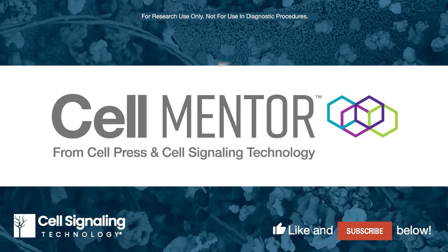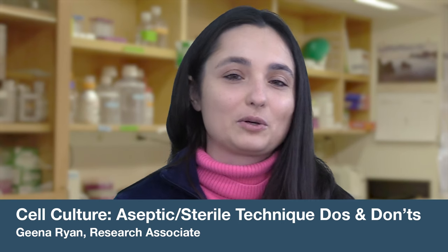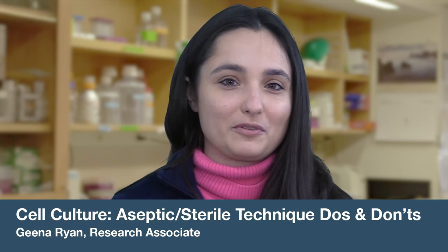Let's talk about how to keep your cell lines free from contamination. I'm Gina, Research Associate at Cell Signaling Technology, and this is CST Tech Tips. If you use cell lines or primary cells in your experiments, you know that sterile technique is crucial to prevent bacteria, fungi, and mycoplasma from contaminating your cells and ruining your experiment. Today, I'll review the basic do's and don'ts of sterile technique, also known as aseptic technique.